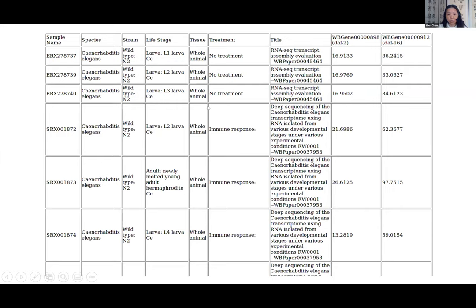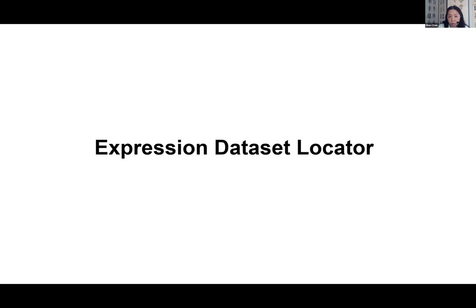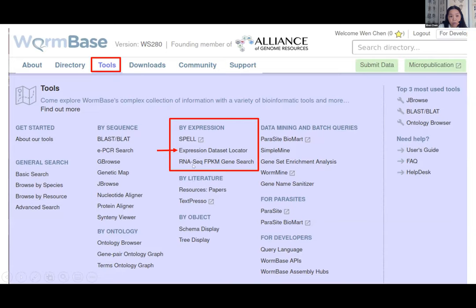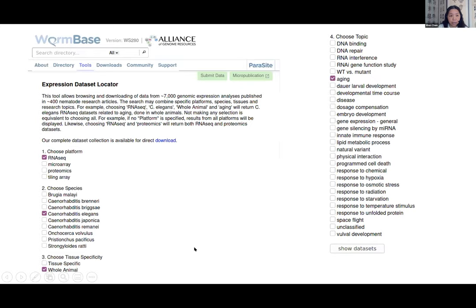The full table contains more than 1,000 experiments, and you can filter by tissue, life stage, strain, or treatment before downloading. For users who want entire datasets rather than individual genes, there's another tool called the Expression Dataset Locator under the Tools menu. WormBase has more than 400 high throughput datasets curated with whole-genome expression values. You can filter by platform — RNA-seq, microarray, tiling array, proteomics — species across nine nematodes, tissue-specific or whole animal, and by annotated topics.